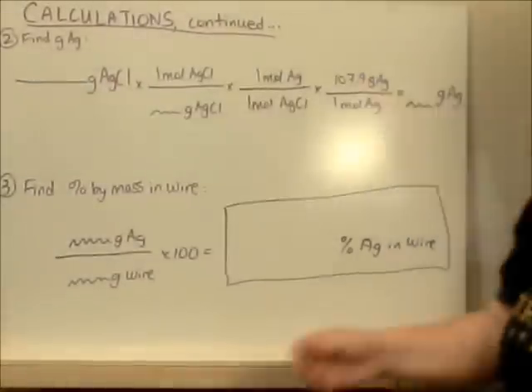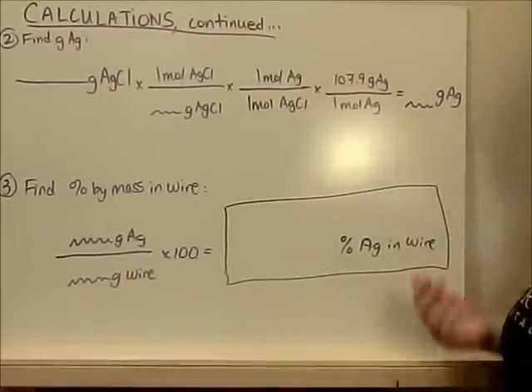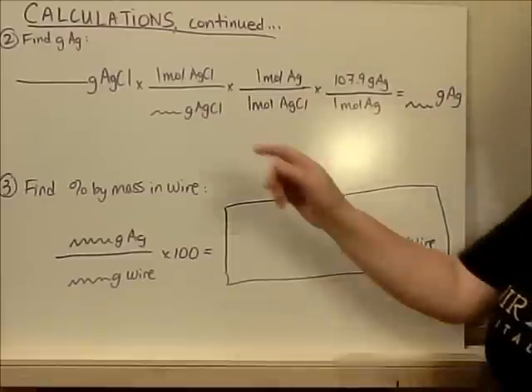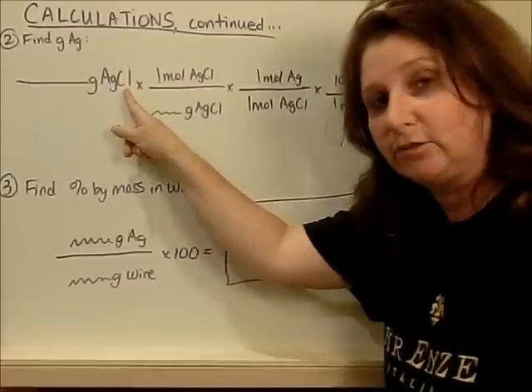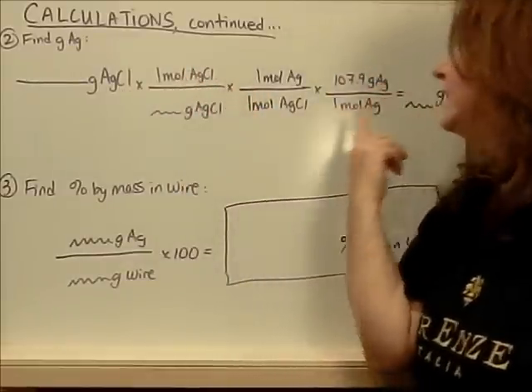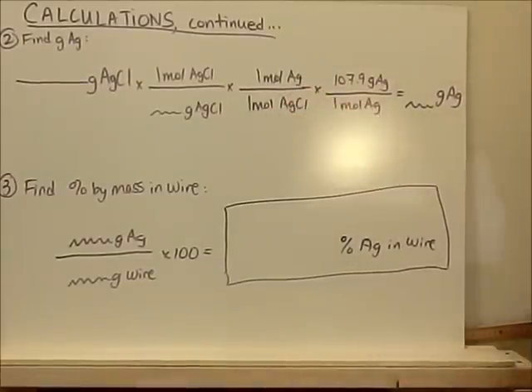And your final calculation is next to the last. So you're going to have to find the grams of the silver. You have the grams of AgCl that you've collected in the Gooch crucible. Convert that to moles. And recognize it's pretty simple. 1 mole of silver is in 1 mole of AgCl. So that's pretty straightforward. Convert that to grams and you've got your grams of silver.